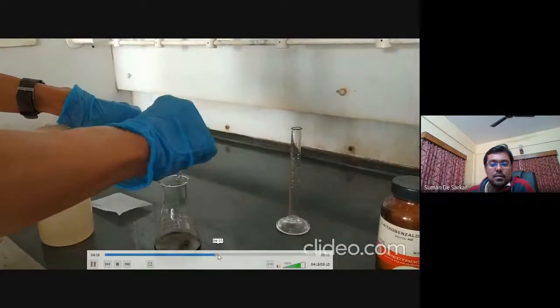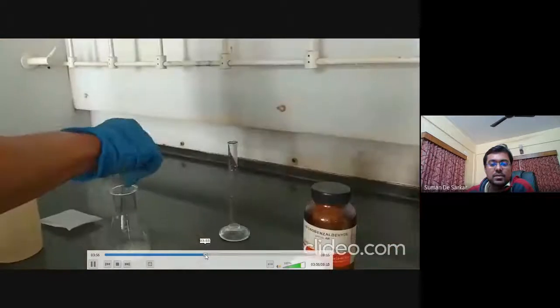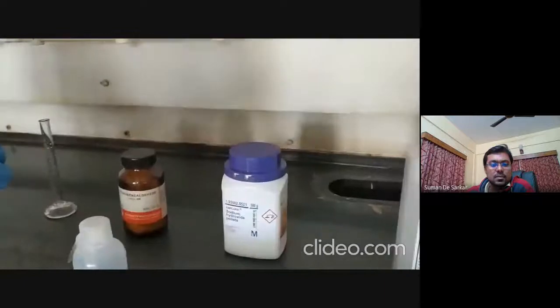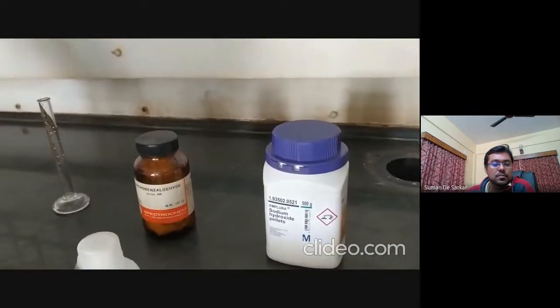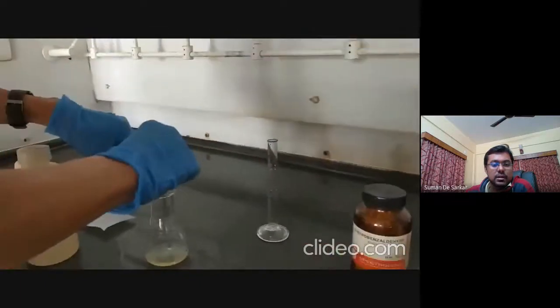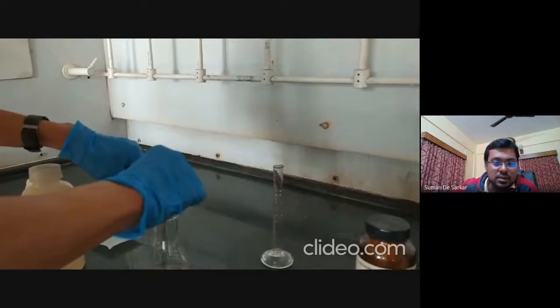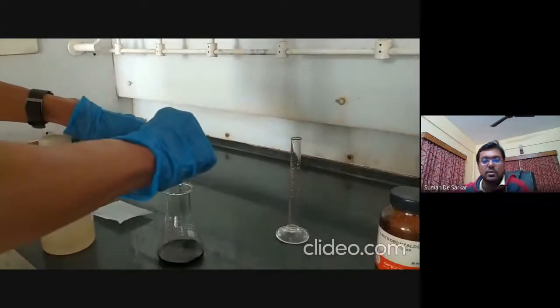And indigo is forming. Let me rewind and then you see. 1 normal. Yes. So we have dissolved sodium hydroxide pellets. By this time he's adding, already added. So all the intermediates are forming. Now the color is changing. You see, yeah, changing already. Okay, perfect. Becoming blue.